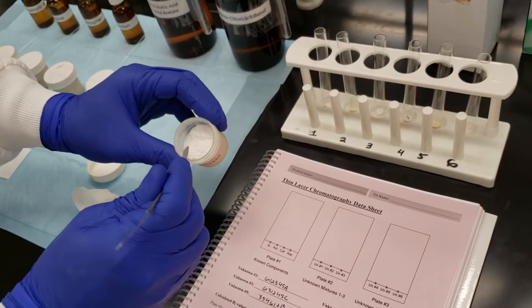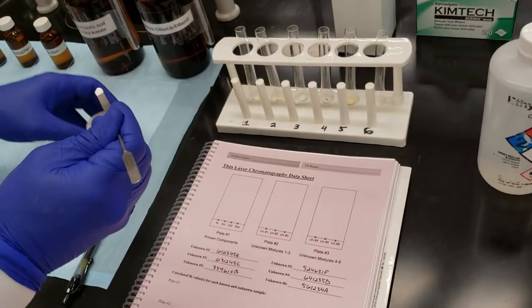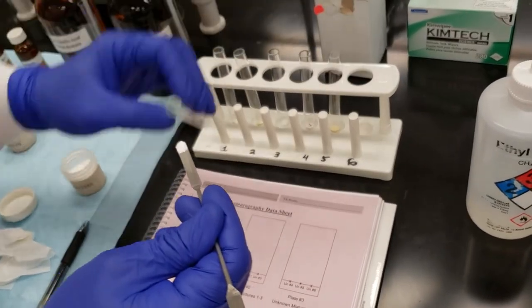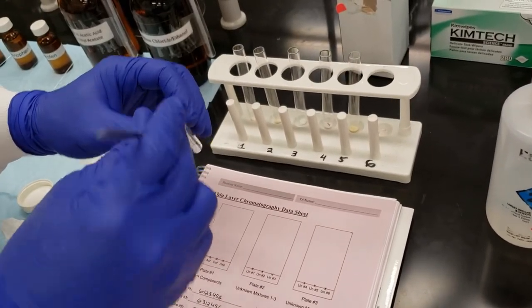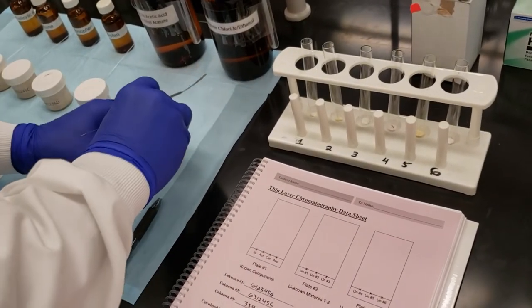This is a nice uniform white powder. It can still be a mixture of several powders, but their appearance and consistency are the same. All right, so now we've got all of our powders in place.